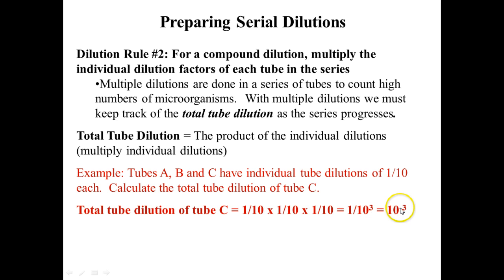Instead of writing as a fraction, if you put a minus sign, that denotes that it's the bottom of the fraction. So that's why we wrote minus on the board, right? So notice the 3 different ways of writing it. I like to stick to writing the fraction so I remember I'm doing a dilution factor, and I'm less likely to lose that little negative sign. But you can do it either way that you feel comfortable doing. And after I have 3 zeros, I usually always write an exponent form, because you're going to eventually lose track of those zeros, right? And it's a pain to keep counting those zeros. It's easier just to keep increasing your exponent.